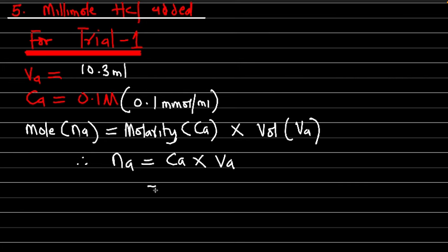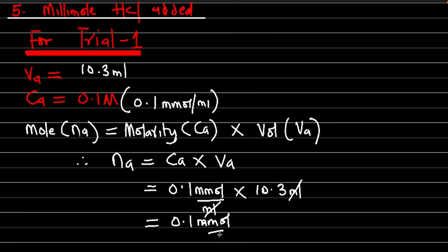So the number of mole of this one: the concentration is 0.1 millimole per mL times the volume, 10.3 mL. This cancels this. Now, the answer we have here is... sorry, that's not 0.1 millimole.